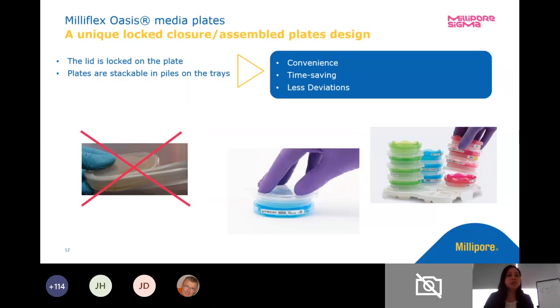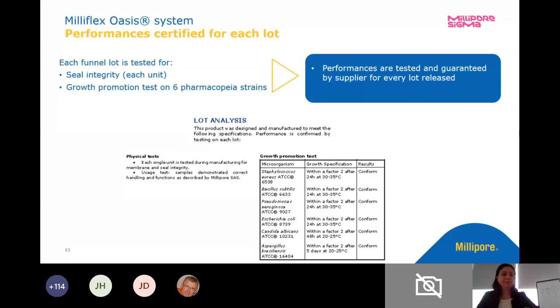There is a different closure on the plate lid too. There's no need for tape. All the plates are stackable. They're pretty secure — once that lid is locked in place, you can stack them on top of each other, put them in an incubator on the tray and go. And since they're color coded, it'll make it even easier to make sure you put them in the right incubator.